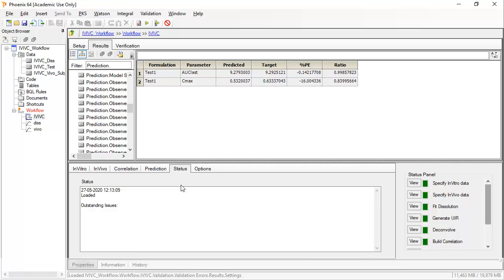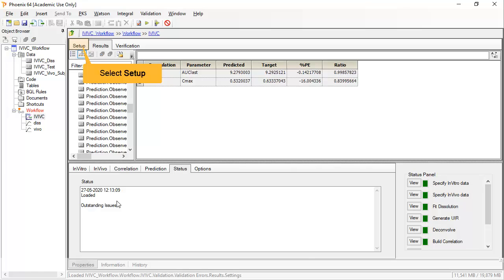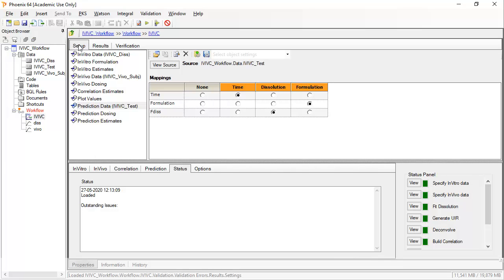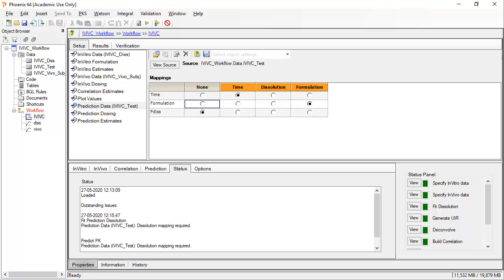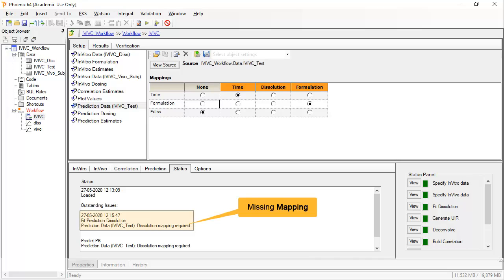Currently, the status tab displays no outstanding issues. However, it can be useful to locate what is wrong with your correlation model if it does not run. Let me show you how by modifying the setup, where I will unmap a required input variable. These missing mappings are then indicated on the status tab.